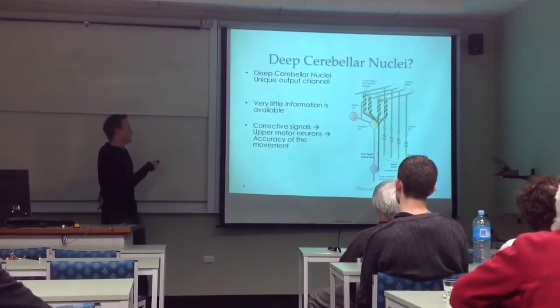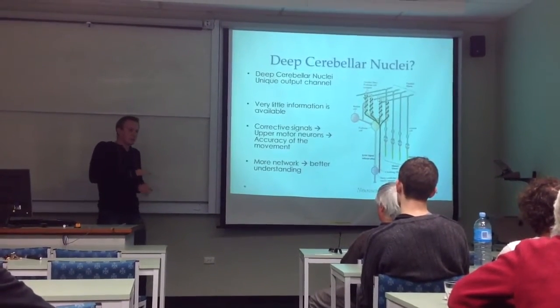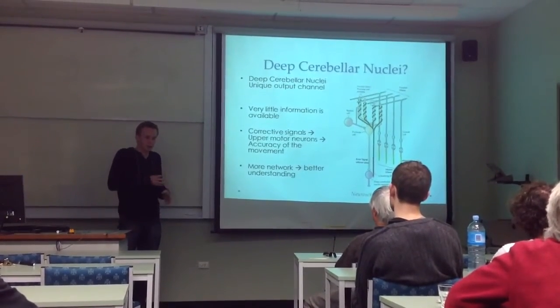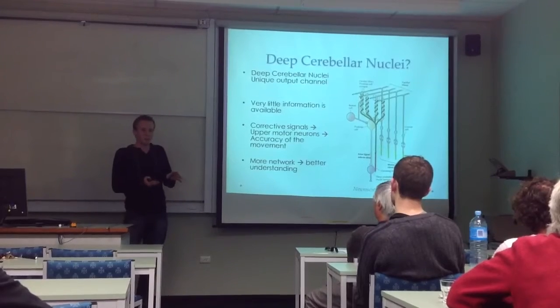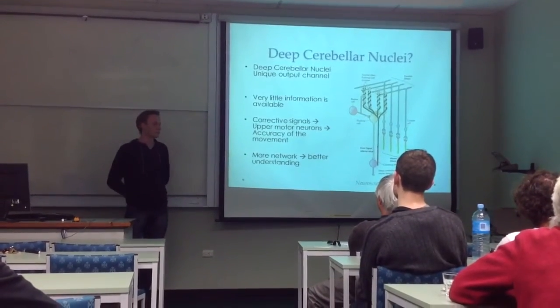So, exactly. The whole aim is to try and maintain as much of the network as we can. So if we could use the whole brain, we'd have the entire network intact, and we'd be able to really integrate and see what's going on. Even if we have to take those 1mm slices, it's a lot better than between the 5 micron and the 40 micron that is currently undergone.